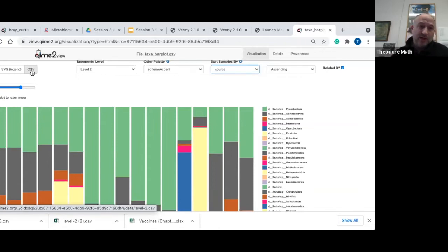So I'm going to go directly from this bar plot data using the CSV file to doing heat maps and Venn diagrams, which are nice things to do to get the students started and really get your hands dirty doing some of the data analysis.